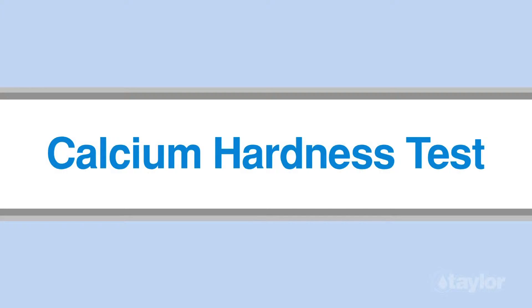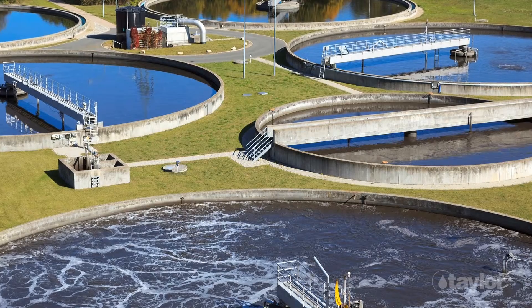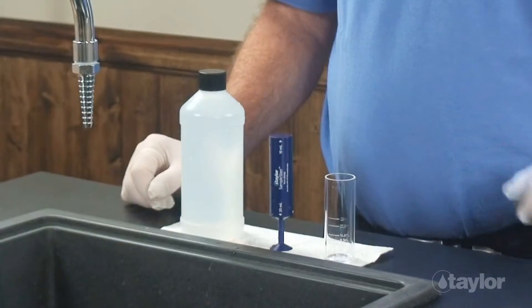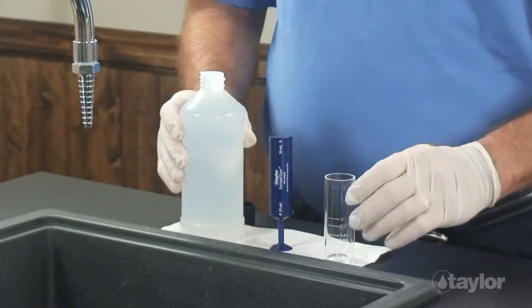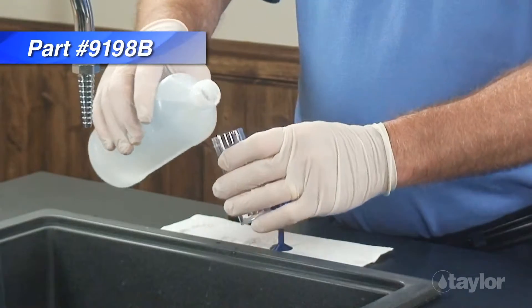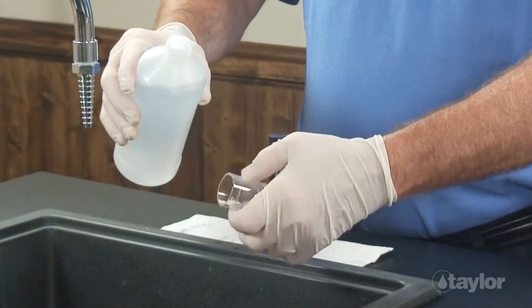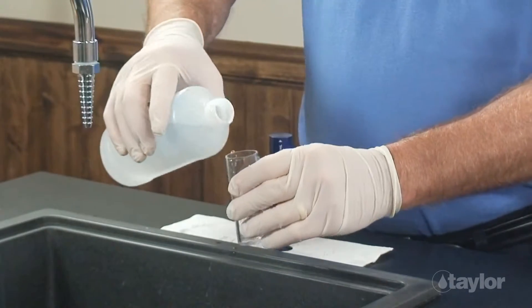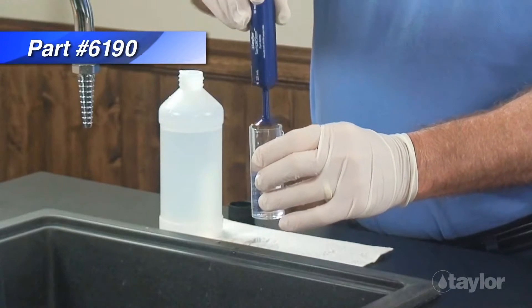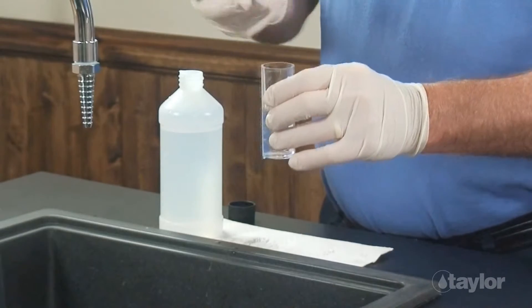We will first perform the calcium hardness test. The water we will be using for our test is the makeup water for the Baltimore City area. Rinse and fill the 25 ml sample tube to the 25 ml mark with the water to be tested. Taylor's sample sizer shown here is a great tool for getting accurate measurements every time.